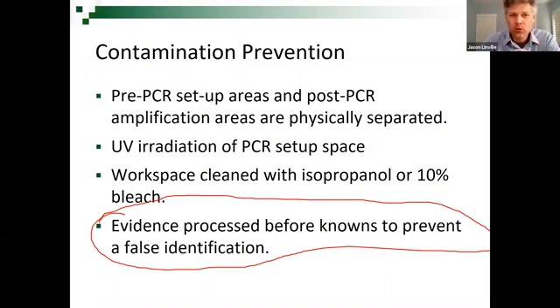Okay, so in order to protect that suspect, you keep their DNA, their cheek cells, in the freezer until the evidence is done. You always process your evidence, your unknown sample. So therefore, if I'm suspected of a crime, my DNA is in the freezer, they haven't touched it, okay? They process the evidence, get a profile that matches me. They know it's not a mistake where they accidentally got my DNA into the evidence, okay? It wasn't open at the same time. It wasn't even open in the lab.